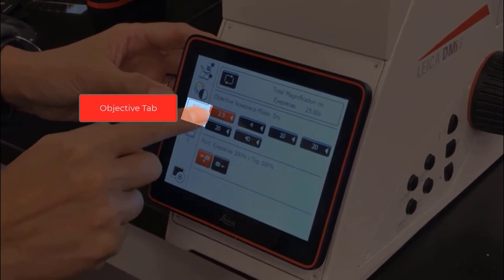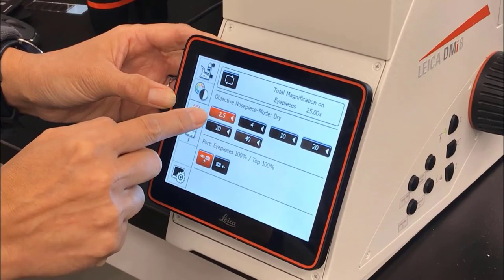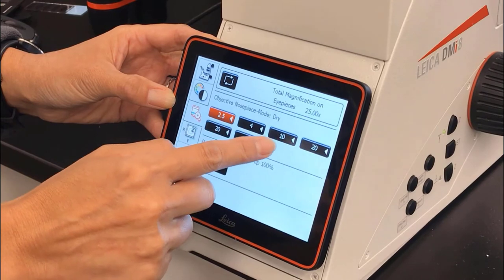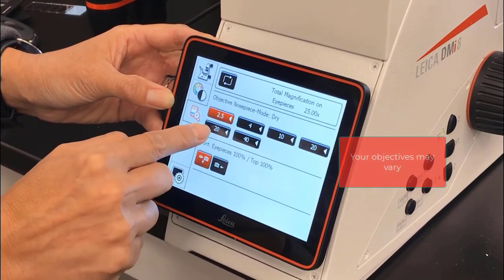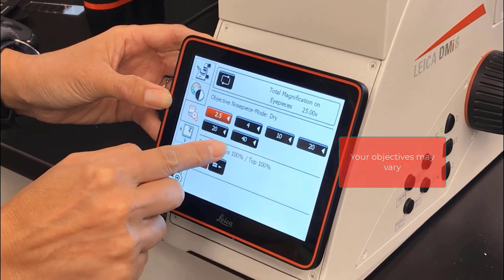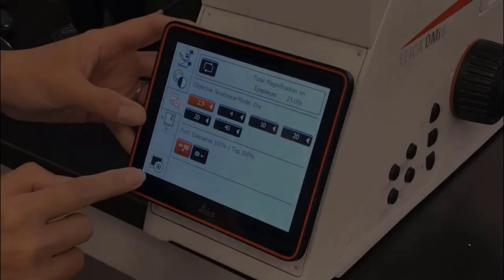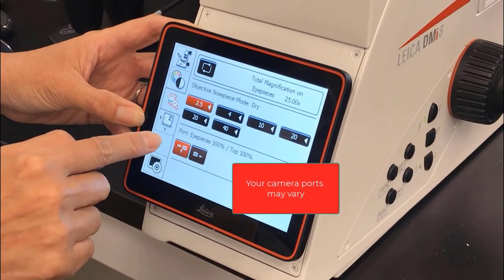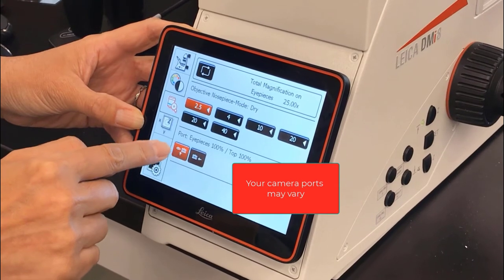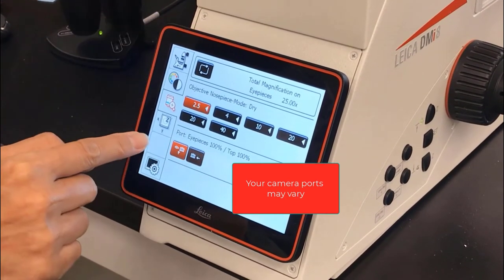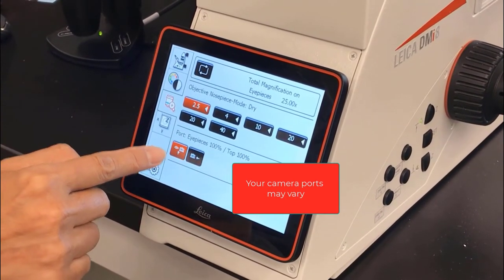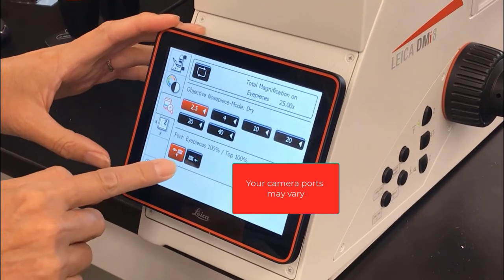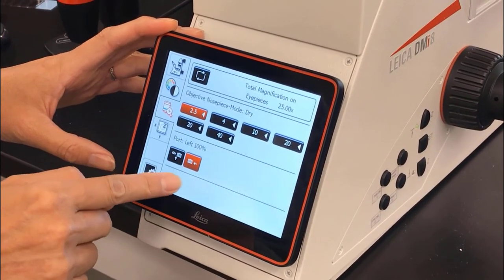Our objective tab shows us we have these six objectives: the 2.5x, the 4x, 10x, two 20x objectives, and a 40x objective. The bottom part of this panel shows where the light is going. Right now it's going to the eyepieces or the top port, which is the color camera. Alternatively, we can switch it to the left port, which is your K5 monochrome camera.